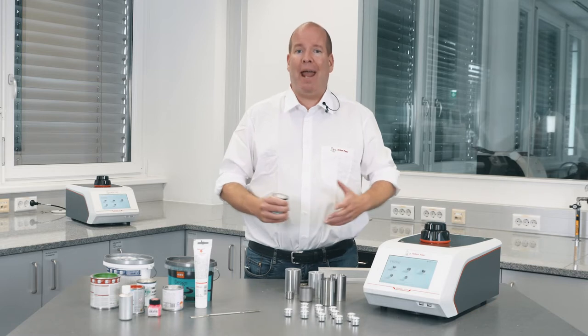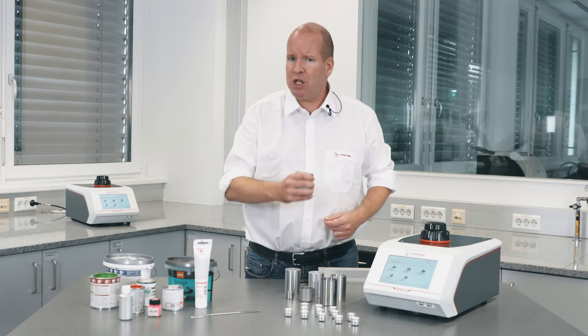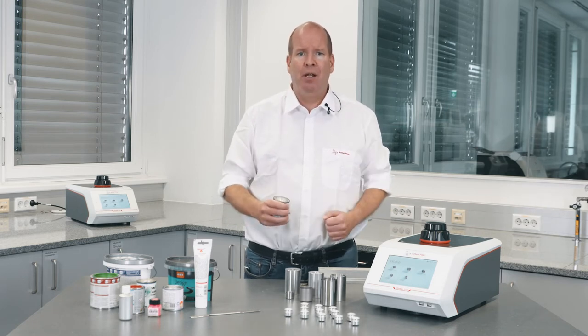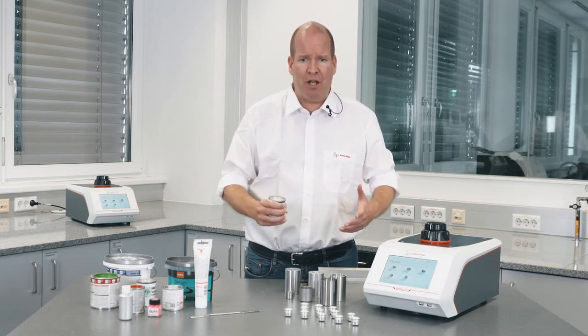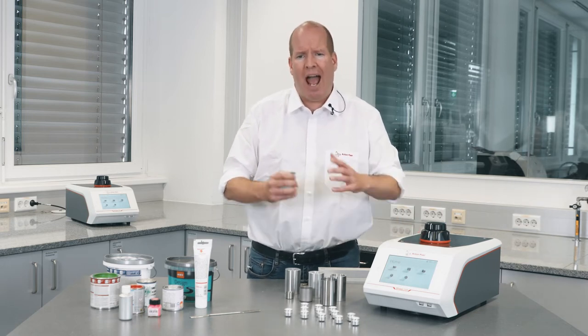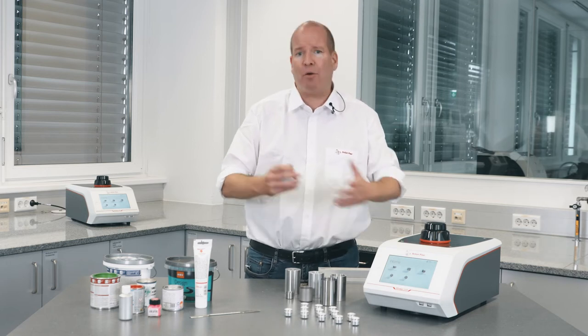Whether the paint tends to settle, phase-separate, or form syneresis, the instrument measures the volume of the whole sample to determine the density. Using the gas displacement method, the Ultrapyc 5000 ascertains the amount of gas required to fill a chamber with and without a sample. The Trulock lid ensures consistent sample chamber volume every time you close it.